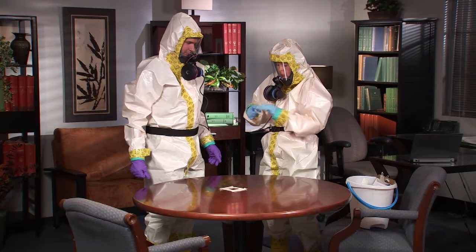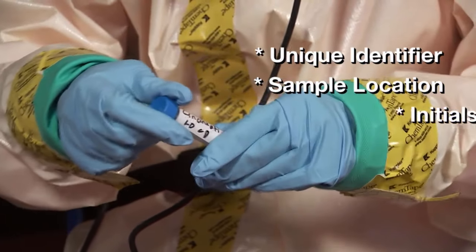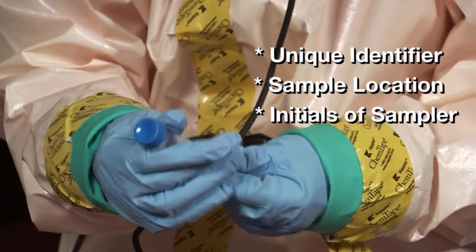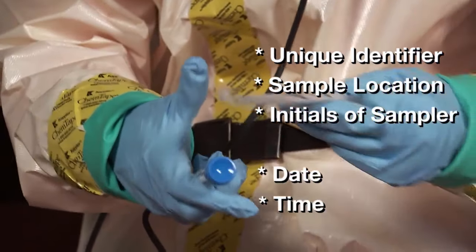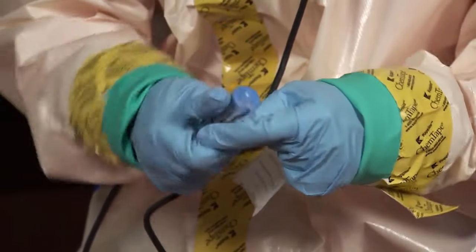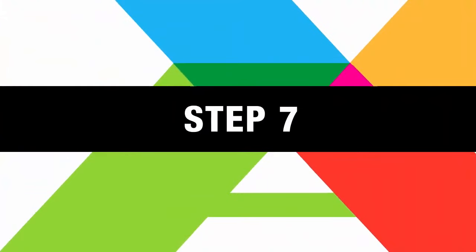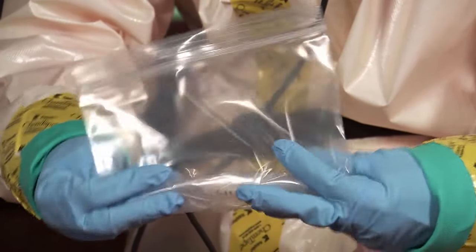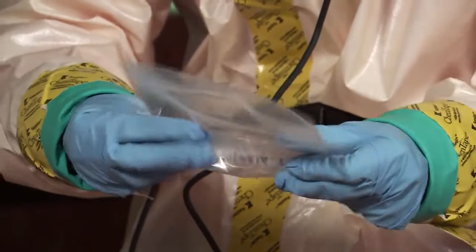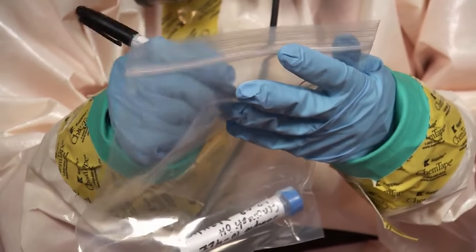The assistant caps and labels the tube with a unique identifier, the sample location, the initials of the sampler, and the date and time the sample was collected. The assistant then wraps the tube with paraffin film to prevent leakage during shipment. The assistant places the sample into a resealable plastic bag, removes any excessive air, seals, and labels the bag with the same information as on the tube.